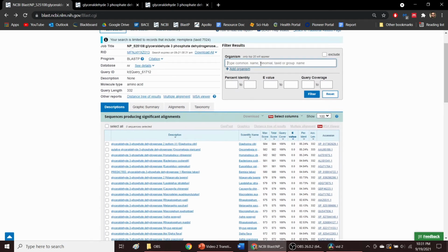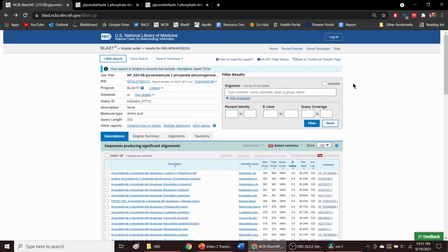The information provided in this video is not extensive, and there are many features that are not explained. For a more detailed description of this page, if there's anything that you're curious about, select How to Read This Report for a file that explains some more details. I will now go over interpreting the Descriptions tab.